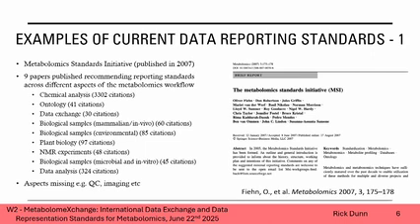And actually, I've included the citations for each of these, and you can see that a lot of these aren't being used a lot, okay? And this is what we're seeing within the current data reporting standards. They're not being used routinely. We're using the carrot approach at the moment, and they're not being used. So that gives a good example of that. The main ones that are being used are chemical analysis, which is to do with metabolite annotation, mainly, and identification.